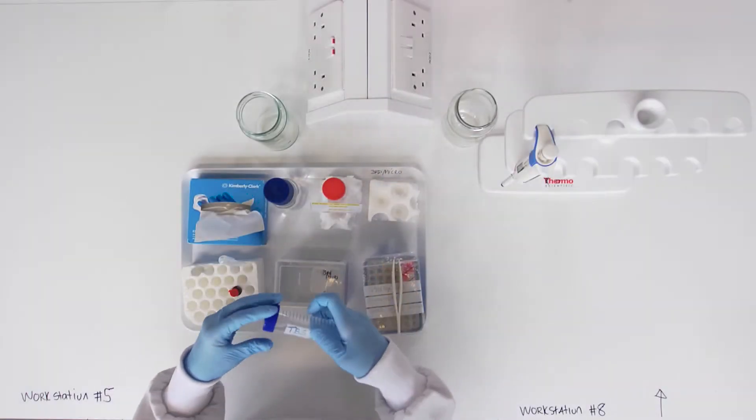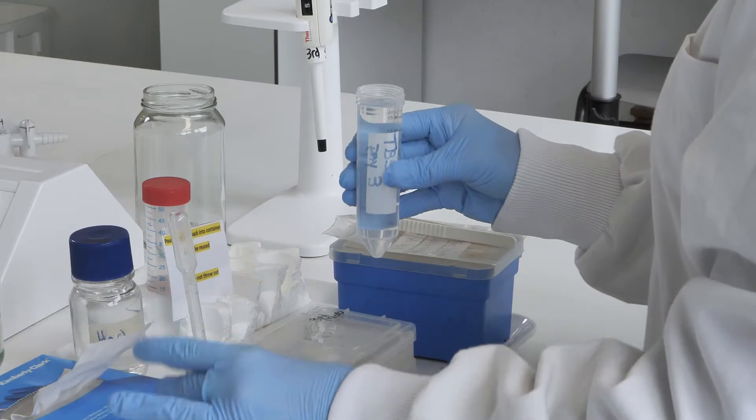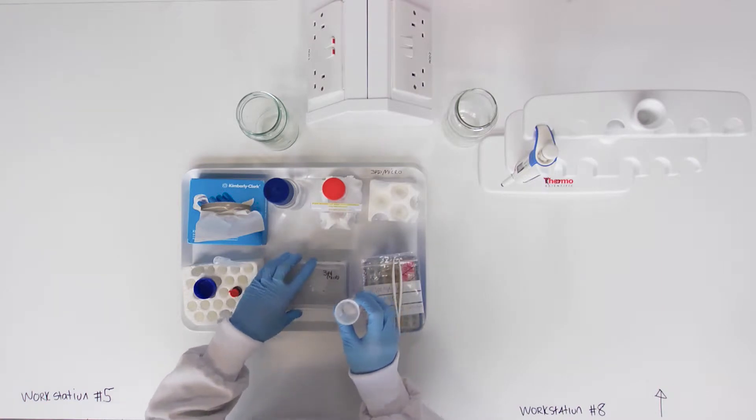After retrieving your membrane, wash the membrane once in 15ml of 1x TBS buffer by adding, swirling, and discarding the buffer solution.